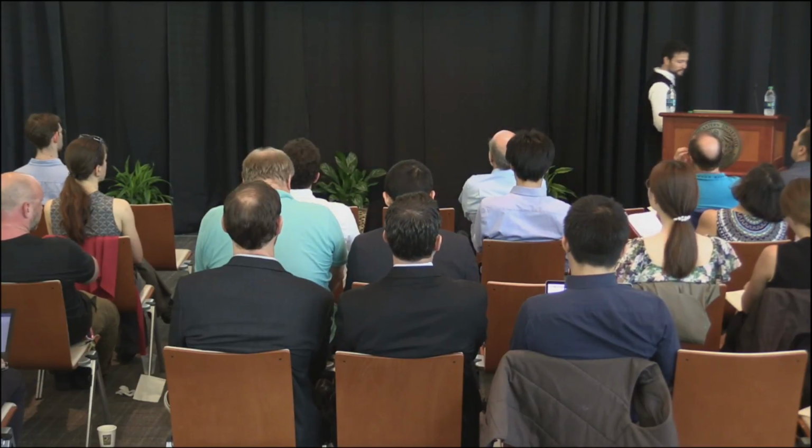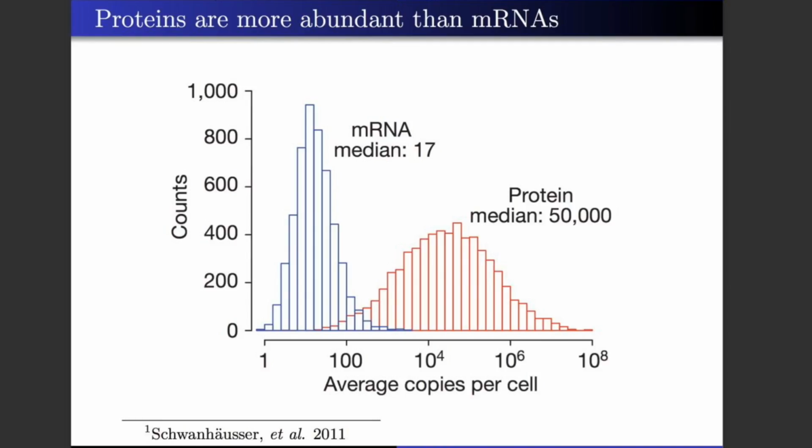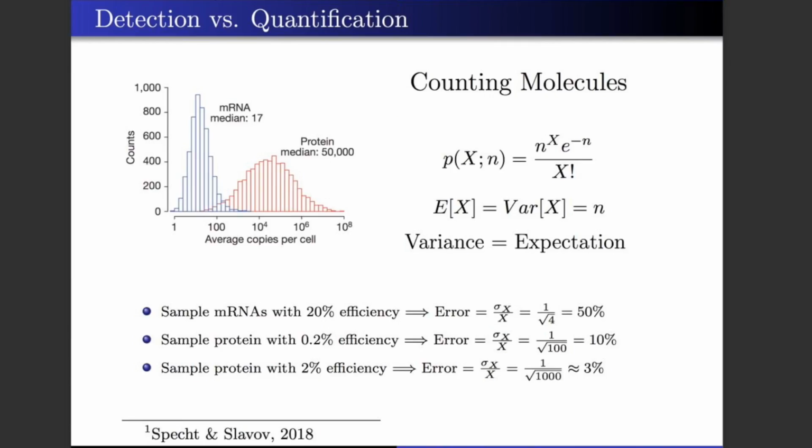It's a good thing, especially because high-throughput methods, such as sequencing and mass-spec proteomics, don't measure every molecule. They sample. We take only a subset of the molecules and we count them. We measure how many we have. And every time you sample, you have to worry about sampling error, sometimes more, sometimes less. But the problem is similar to picking blue and red balls from a bucket.